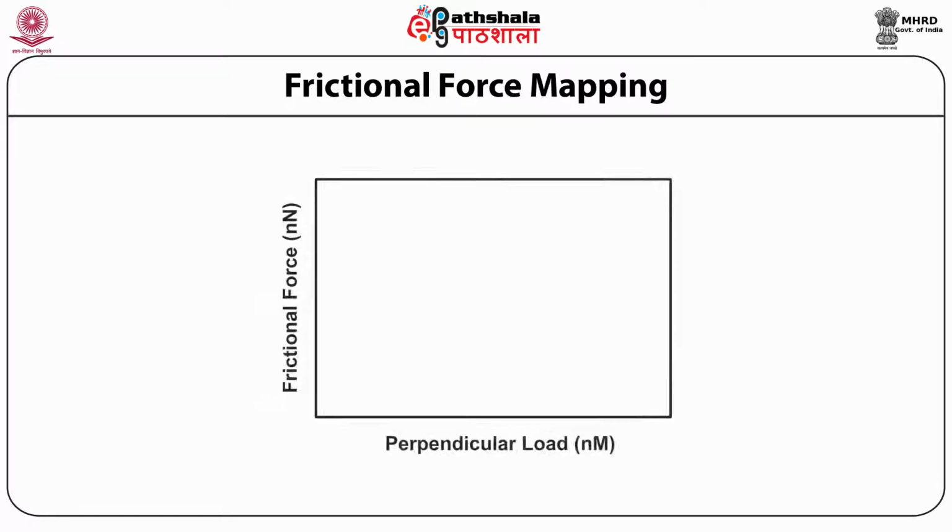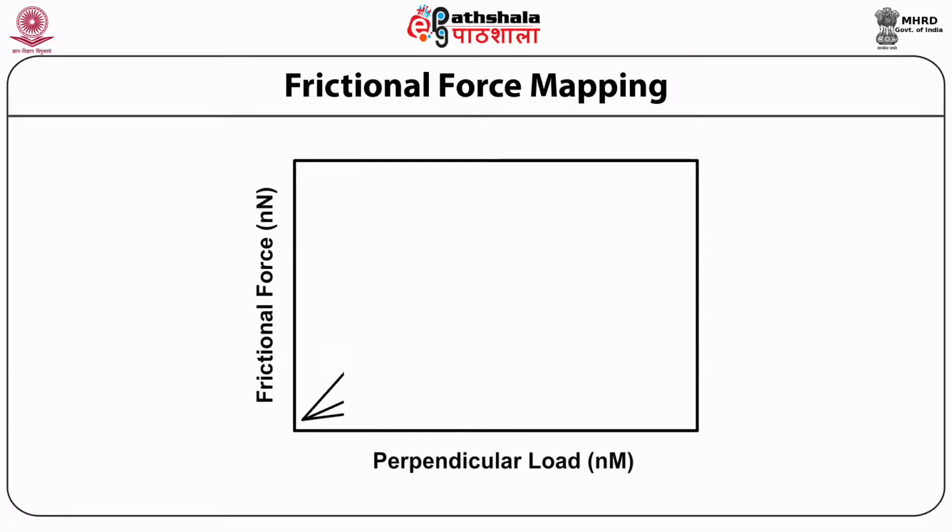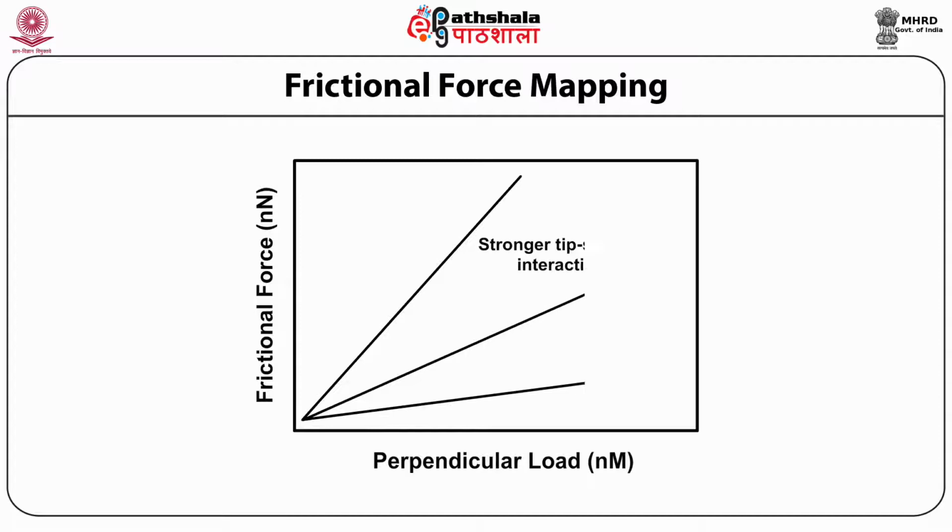Frictional force responds to the amount of perpendicular load applied by the tip onto the substrate, as shown in the figure. Increasing tip-substrate interactions provide a steeper slope, as one would expect.